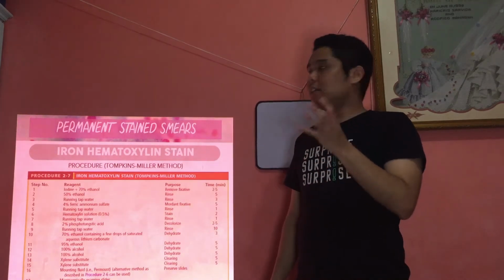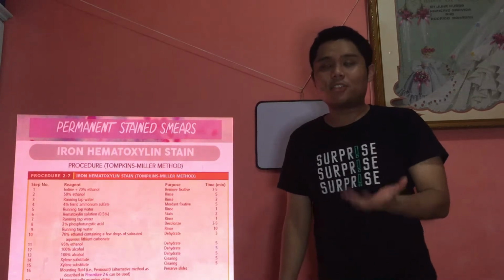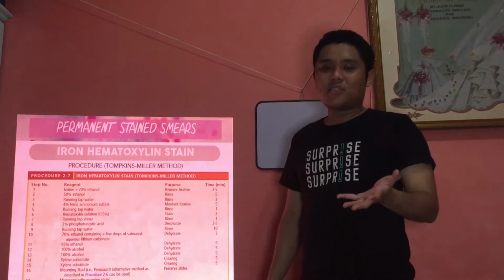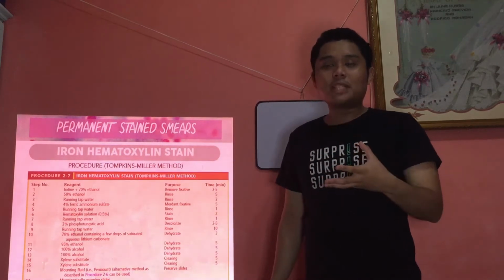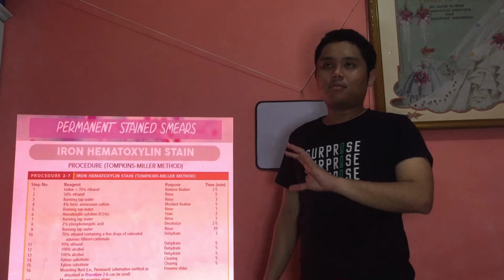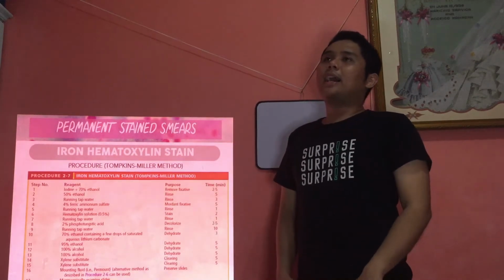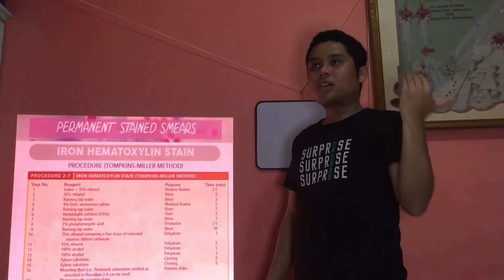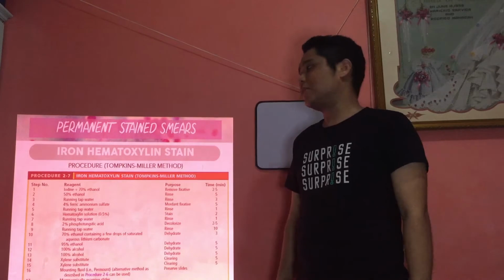Very good advantage of iron hematoxylin is that it can produce, again, as I mentioned, good staining results, even if the one who performed the staining is unskilled, like first timers like us or beginners pa lang. All right, so it's not that technical compared to Wheatley's trichrome. Okay, so that's a good advantage of iron hematoxylin.